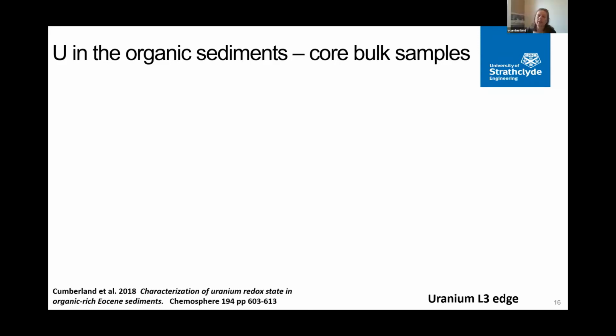It does indeed, yeah. I think they're much better and faster now. When I did it, it wasn't a routine technique, so it was a whole overnight process to do one sample. They've been doing this for a while. That paper, the biosolids paper, has been out for quite a while. So I think they're much better tuned now, but it's not a fast technique, but it's a spatial technique, which is very useful.